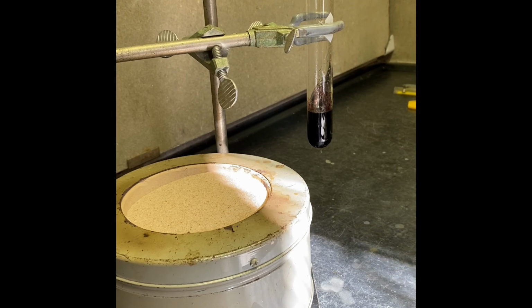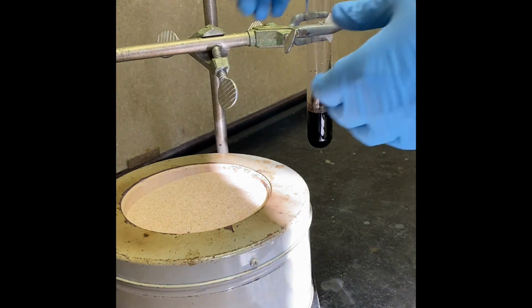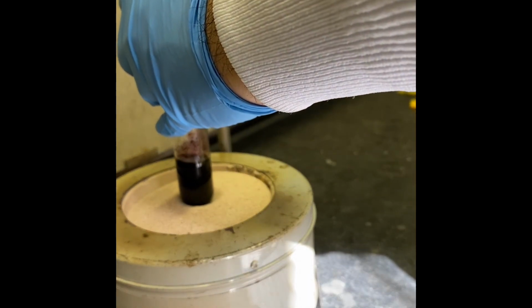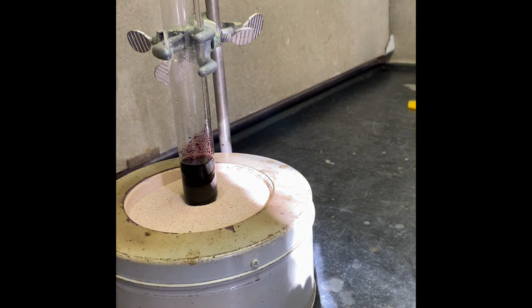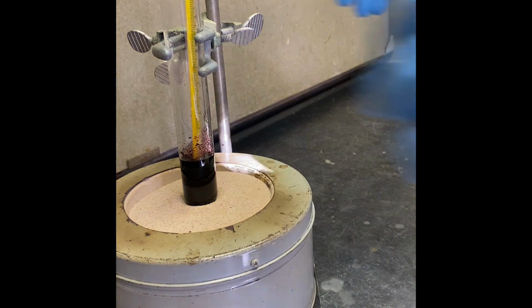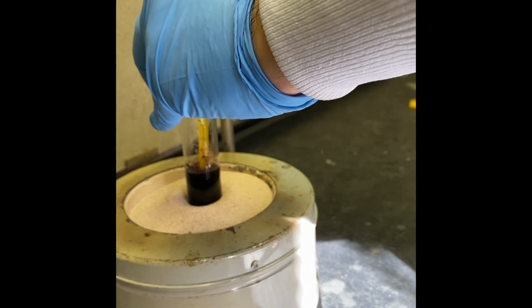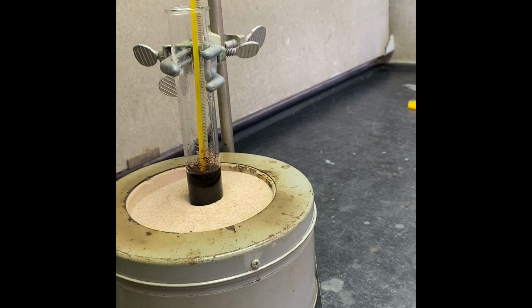We add 1 milliliter of dimethyl acetylenedicarboxylate, and now we can put that in the sand bath to start our reaction. And during that time I will check the temperature with the thermometer. And we're gonna wait till reaction is done.